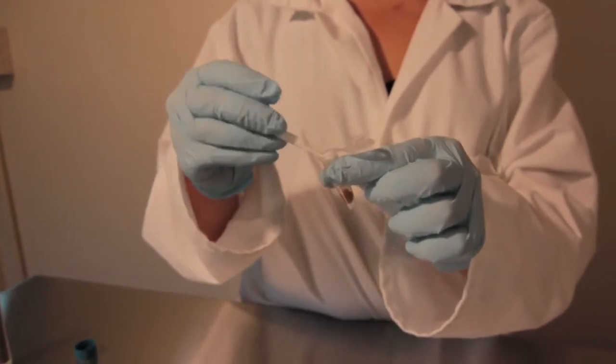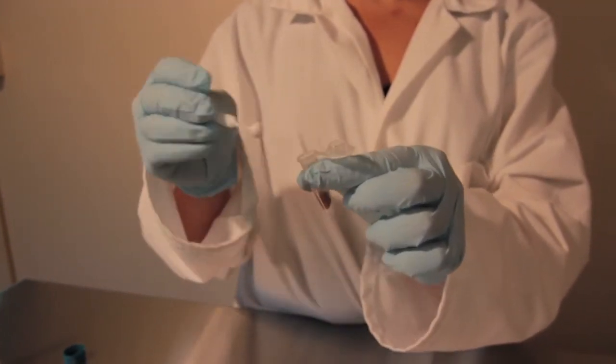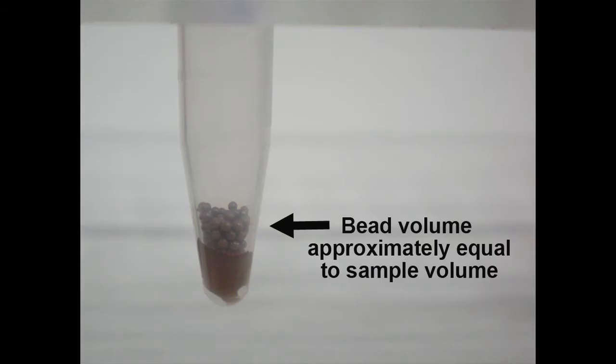Second, add your beads to the sample. For very soft samples, such as brain, you can use glass beads. These beads have the lowest density out of all of the beads we carry. If the sample is a little tougher, or if you just want to play it safe, use zirconium oxide beads. I recommend using a volume of beads that is close to the volume of your sample. If you would like to add beads by mass instead of volume, check out the protocols on our website, www.nextadvance.com, for more specific information.